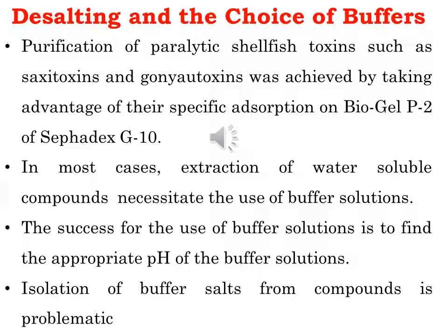Sometimes this process has to be repeated several times. It is usually necessary to redissolve the residue in large amounts of water, freeze and lyophilize again. In other cases, one has to expect drastic pH changes during evaporation which may affect the desired molecule.